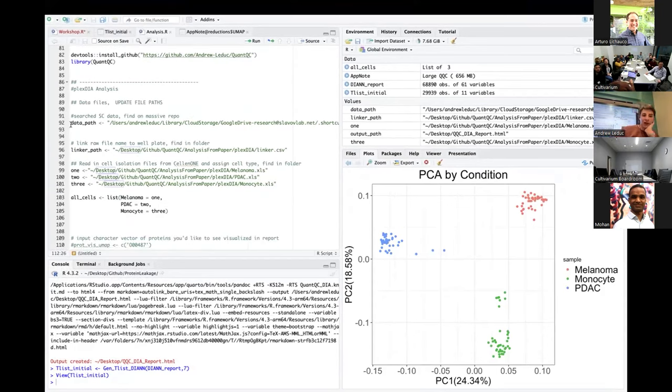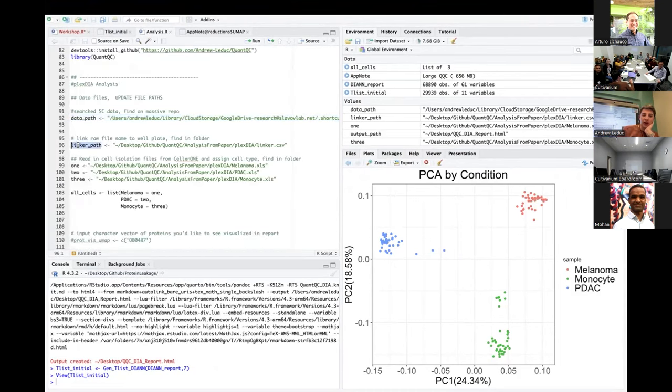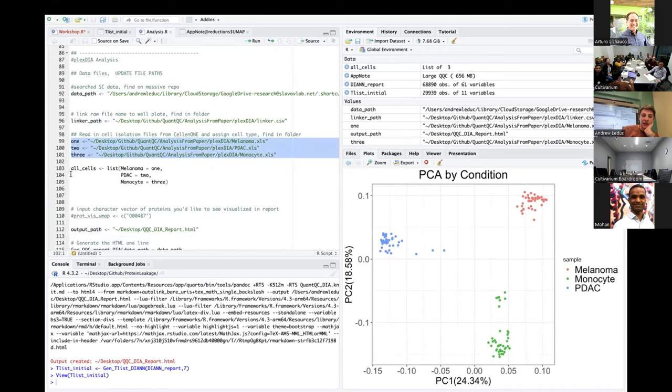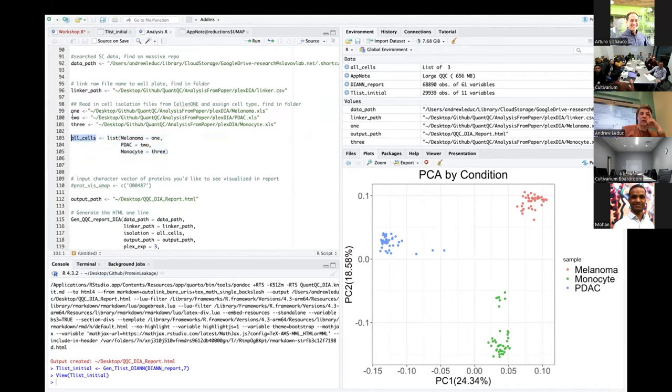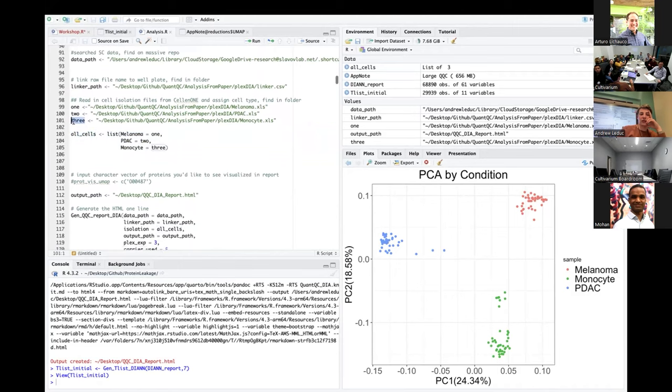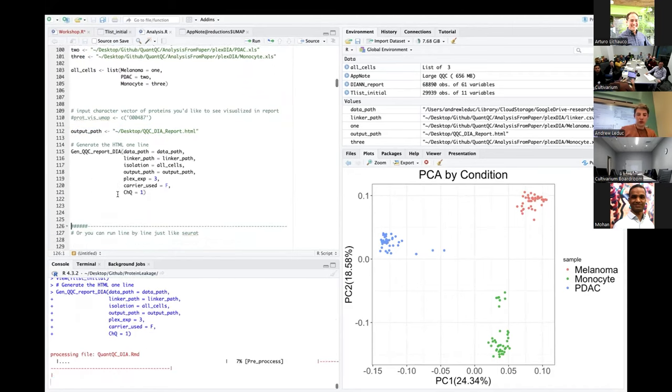So we're going to do some live analysis here. We have the data path that I have. It's on Google Drive, so this is a really long path. My linker, which is just in this GitHub folder that's on my desktop, and also these isolation files. Take these isolation files and put them into a named list. So you can see pretty straightforwardly, like one should refer to melanoma, and so I just called it that. You can name these whatever you want, but essentially it's just to simplify the inputs to the function. So I have a list, which is just storing the file paths, just the strings to the file path for these three things. Then I have my output path. I want to put it on my desktop. And there's this generate report function, which I'll just run.